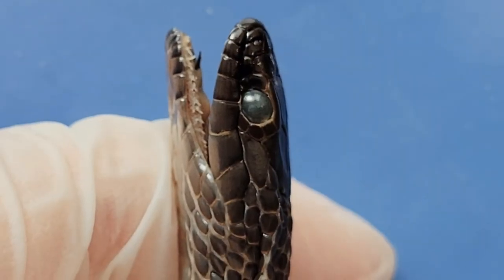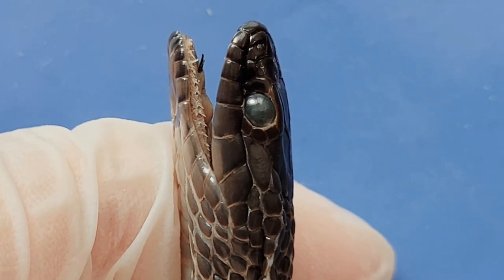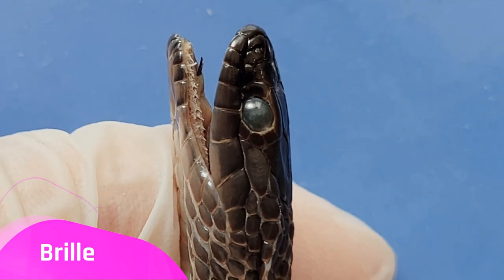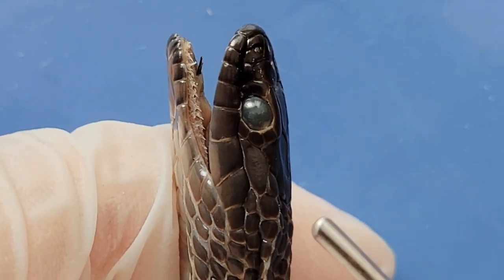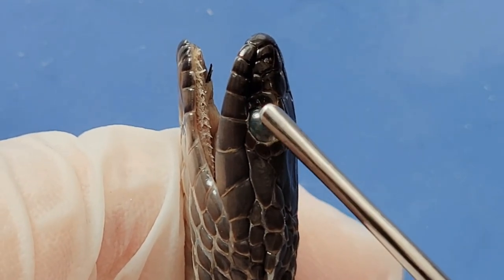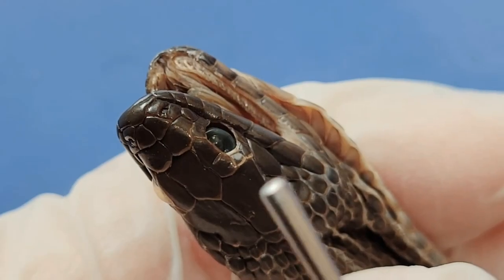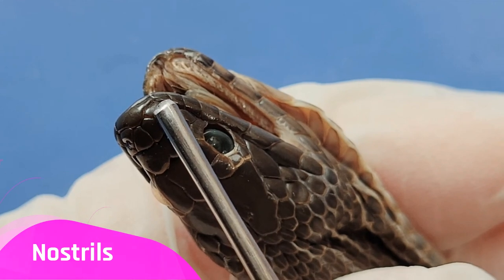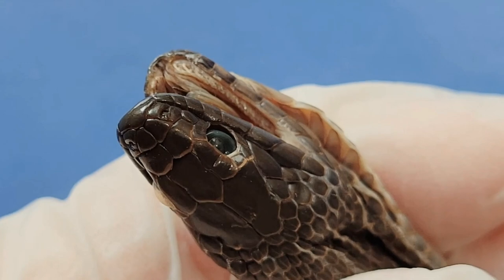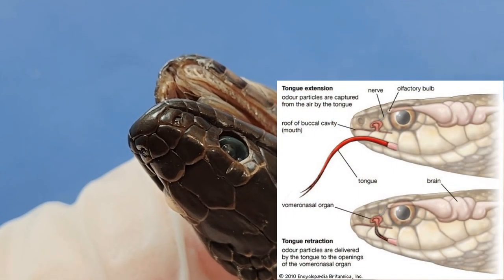Now let's take a look at the head of the snake. Snakes don't have what we think of as eyelids. Instead, they have what's called a brille, which is a kind of clear, immovable scale that covers each eye, visible right here. Since they don't have eyelids, snakes can't blink. Here are the nostrils of the snake, here and here. While these nostrils are used to breathe, they're surprisingly not used to smell — instead, snakes smell with their tongues.